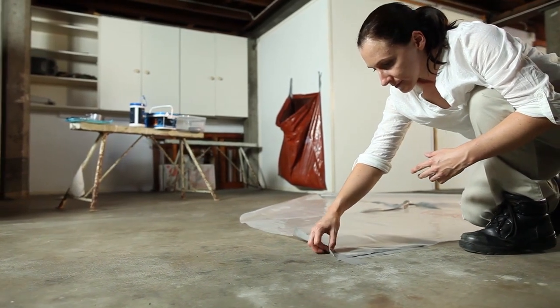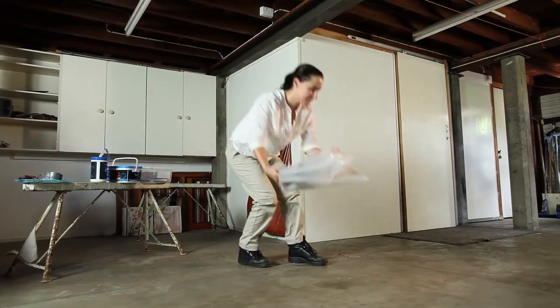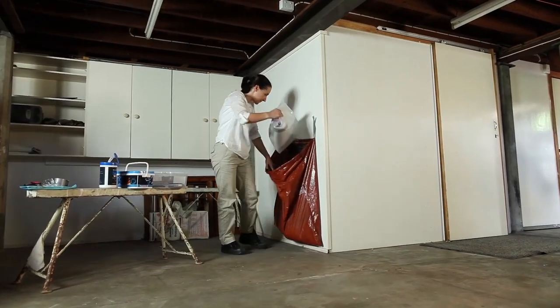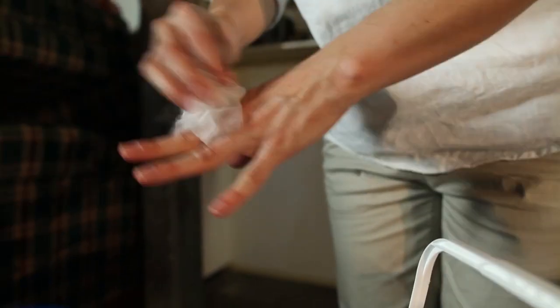Safely dispose of the plastic on the ground by folding it inwards and placing it into the waste bag. Then wipe your hands with a wet wipe and wash them as soon as possible.